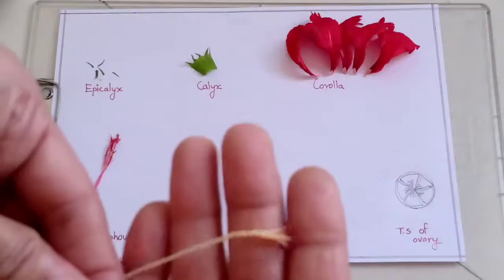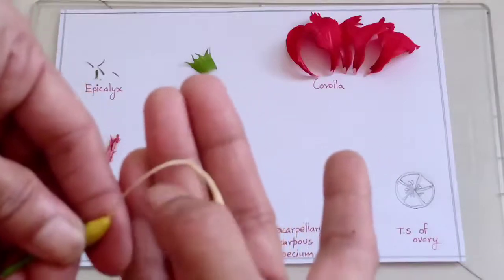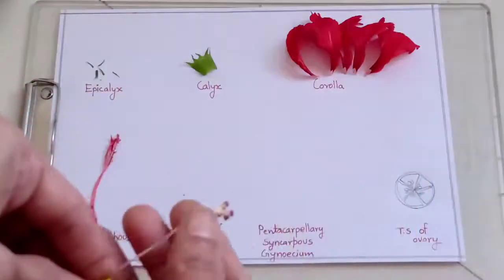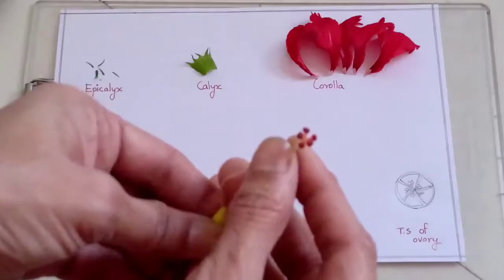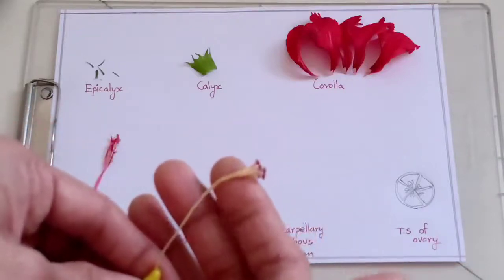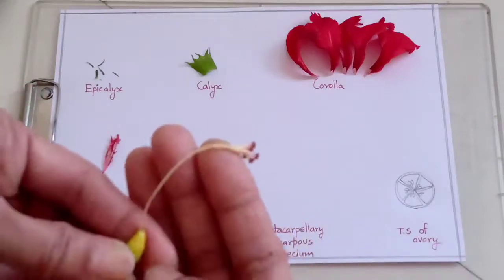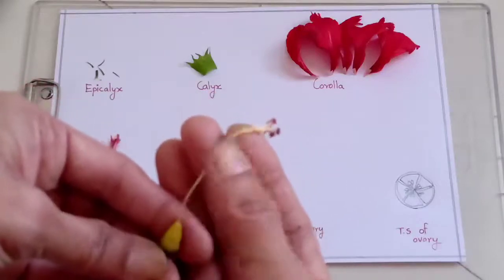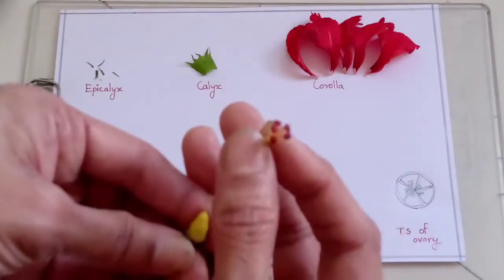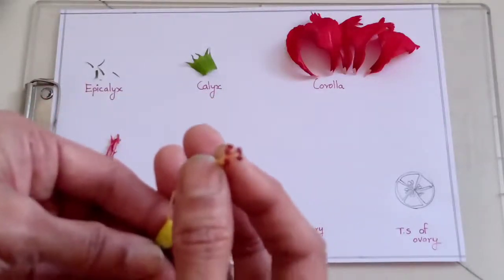Now, I have only the female part, that is the gynoecium. Okay. Below, you can see, this is the ovary, this is the style, and at the top is the stigma. And on the stigma, you can see, just wait, I will show. See, you can count here 1, 2, 3, 4 and 5. Here it is pentacarpillary syncarpous gynoecium. Syncarpous means carpels are fused. The ovary is superior, here you can see. The style is long. The stigma is pentafid, here you can count, just see at the tip 1, 2, 3, 4 and 5. Fine. So the stigma is pentafid and capitate.